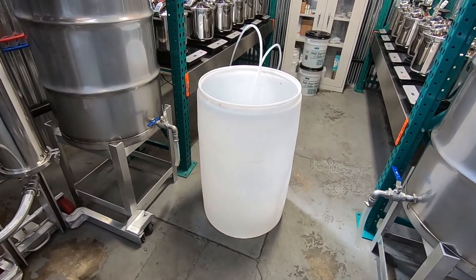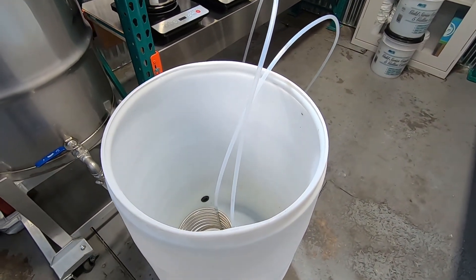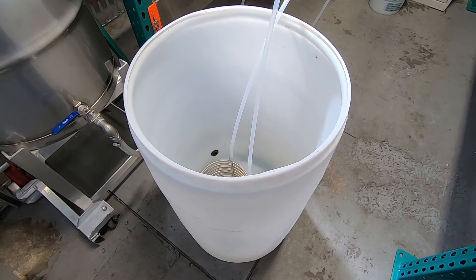I told you guys I was going to show you how to condense and reclaim your alcohol without a chiller. You can see the running theme here is operating without spending money on a chiller.